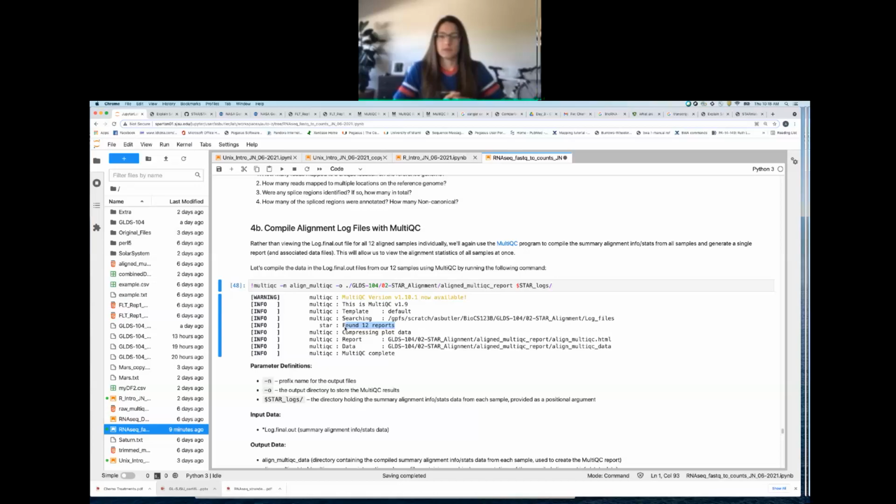Combined forward and reverse, yeah. So we're not seeing the forward and reverse reads separate, right? When we do the alignment, we tell it as an option in the alignment that this is paired. And so what it does is it considers that forward and reverse of course coming from the same sample. So it's giving us the alignment file for those mate pairs for each sample. So then we're left with a log file, and also a BAM file of course, and all of our outputs, 1 per sample.